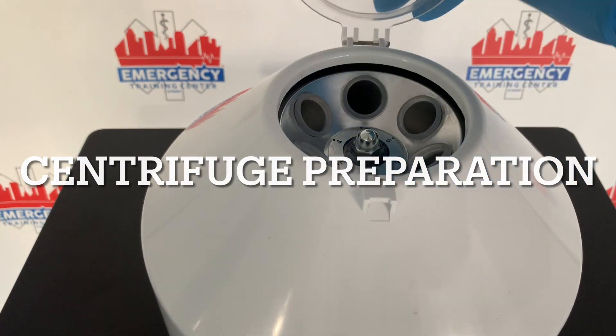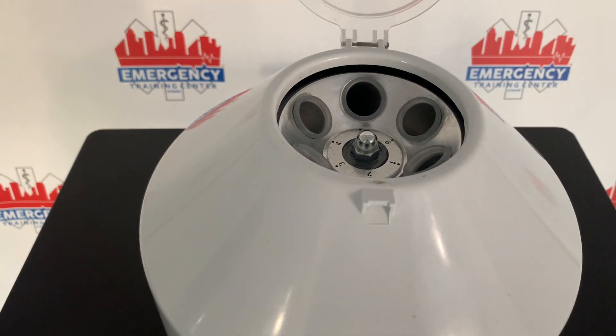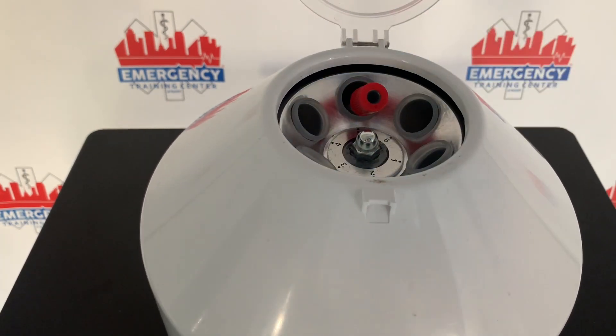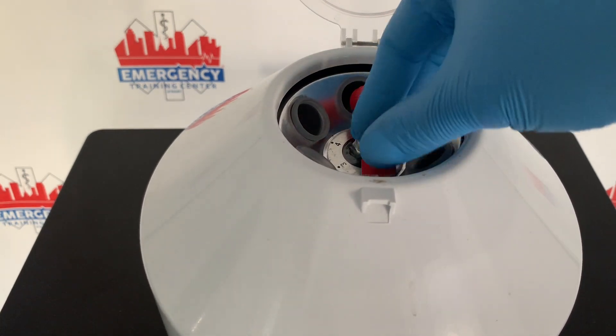Today I'm going to show you how to use a centrifuge. You want to make sure that you open up the lid, make sure that nothing's in there, and then place your specimens into the machine.